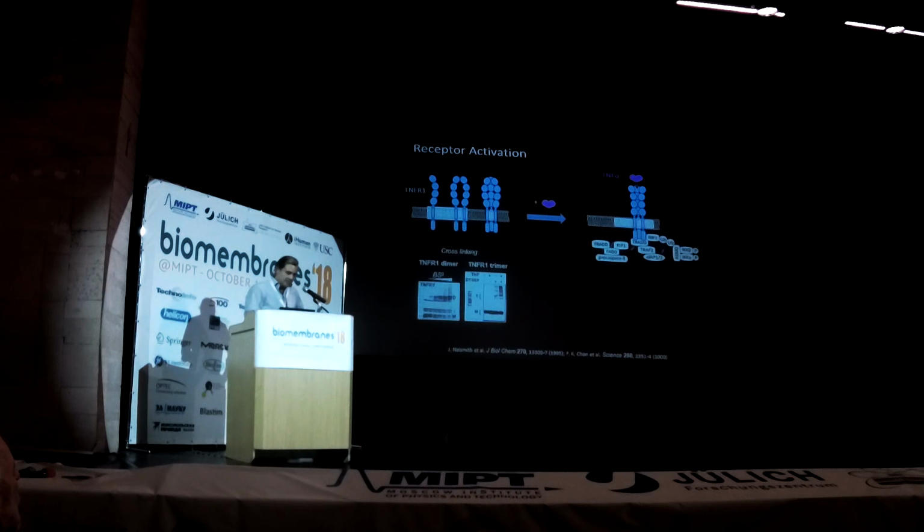And TNF receptor is a very interesting one because it can induce two very different responses, which is cell death or NF-kappa B activation, proliferation. And somehow this is related to these membrane-bound receptor hubs which form. So it's a very functional state. Now I promised you super resolution will close again, but there's one thing I didn't say.